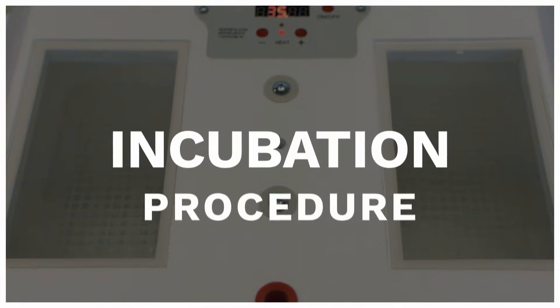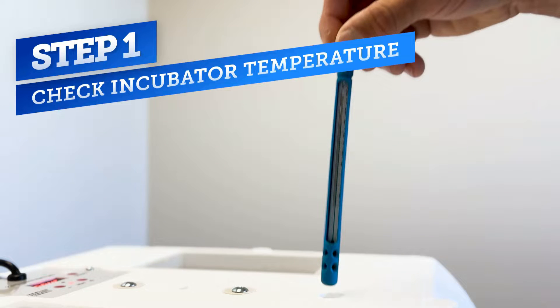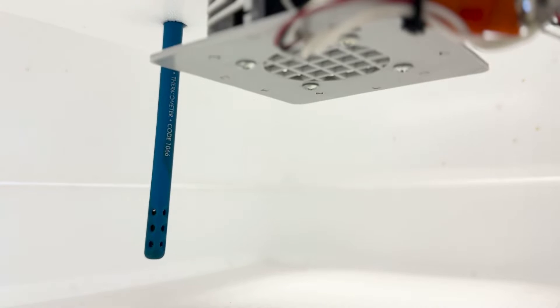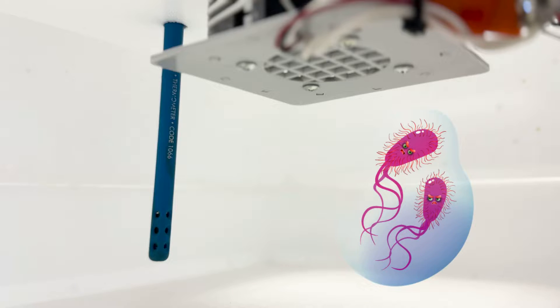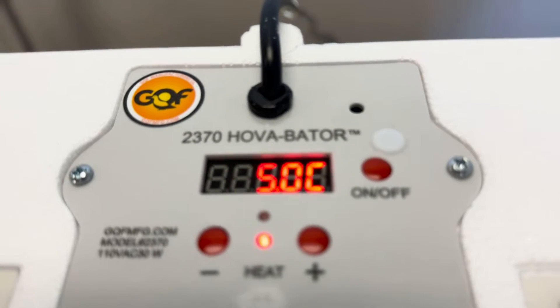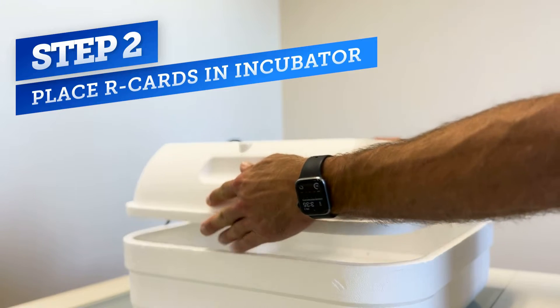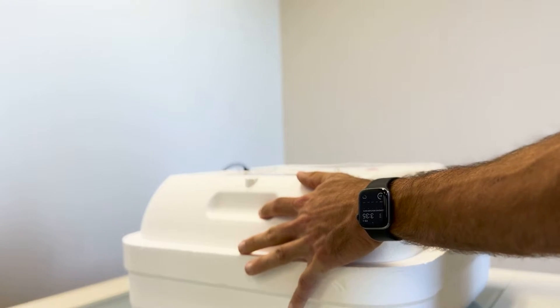Now that we've collected all the samples, we need to incubate the inoculated cards. Before placing the cards into the incubator, we want to validate that the digital readout is accurate and maintaining a temperature between 35 and 38 degrees Celsius. To do that, we use a secondary thermometer to perform a check. If the R-cards aren't kept at an optimal temperature, E. coli colony growth will be slow and some mortality may occur, allowing other species of bacteria to be favored. After about a minute, the temperature on the thermometer should have equilibrated. Since our device and thermometer are reading 35 degrees Celsius, we can proceed to place the R-cards into the incubator. You should plan to put the R-cards in the incubator within three hours of sampling and incubate the cards for 20 to 24 hours before counting. You can stack up to 15 cards in one cycle, and always make sure to record the incubation start and end times on your datasheet.